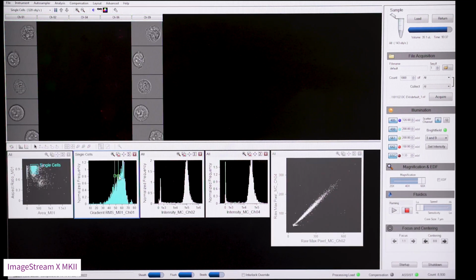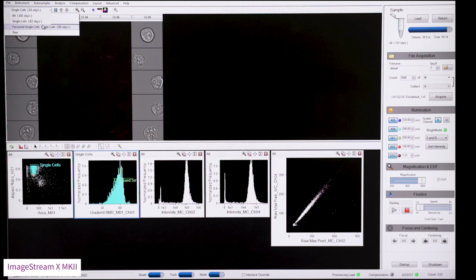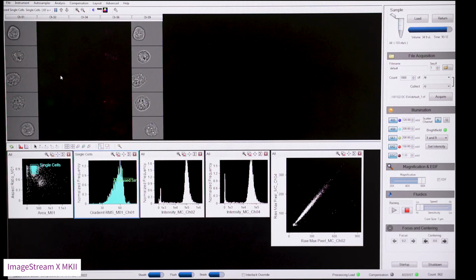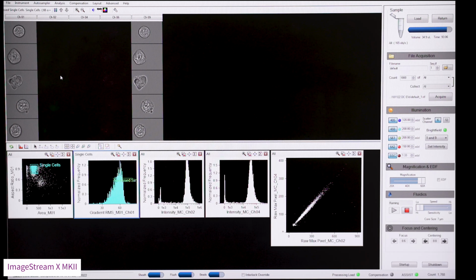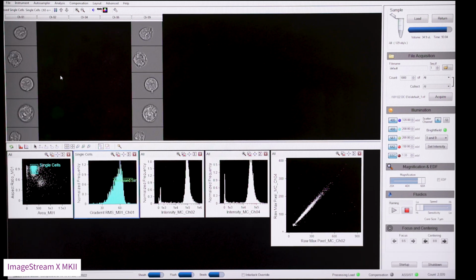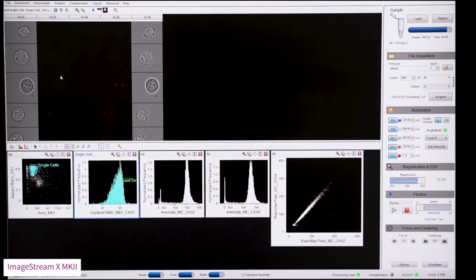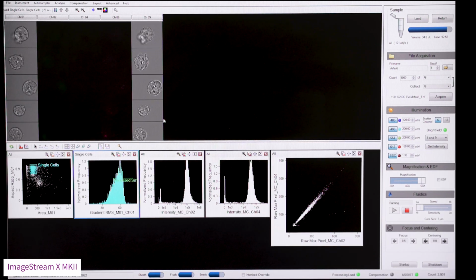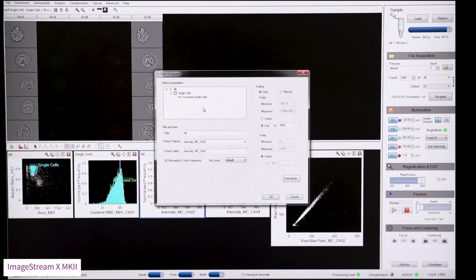So we can create a region around the events that are in focus. We can select to view those at the top drop-down menu. So our two quality control regions are in place to identify our single in-focus cells, and we can apply these to our remaining plots by right-clicking each plot in turn and choosing Properties and selecting the single in-focus cells at the top.